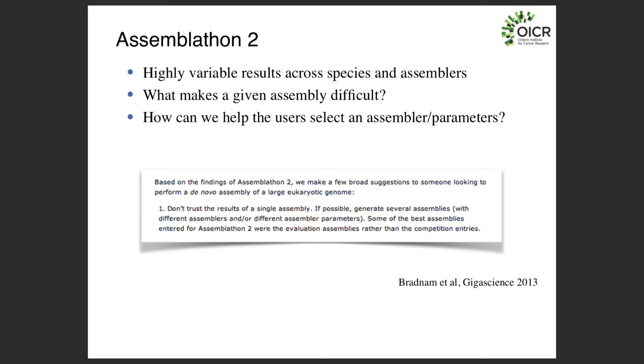I guess if you don't have a reference genome to compare it to, nothing. Like if it's completely new, and you don't have anything to compare it to. Yeah, and to verify. It's going to be difficult to do the analysis of whether your assembly is good or not, for sure.